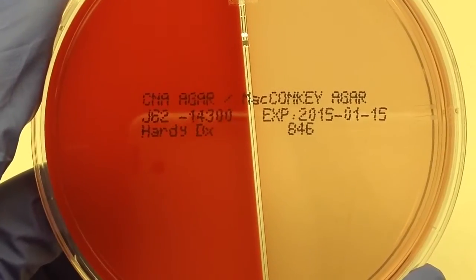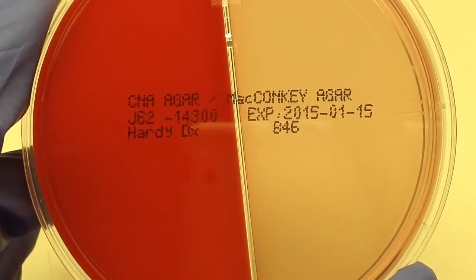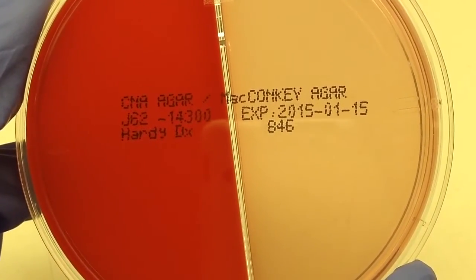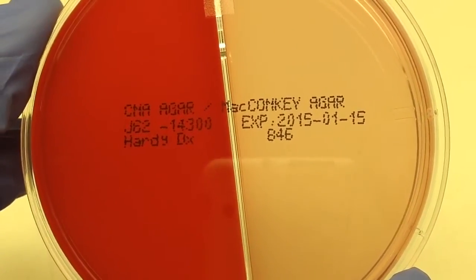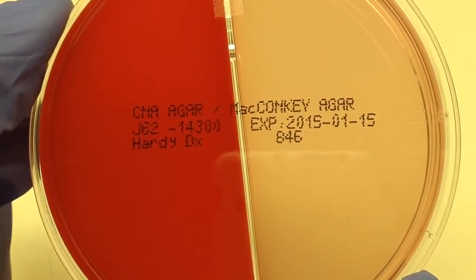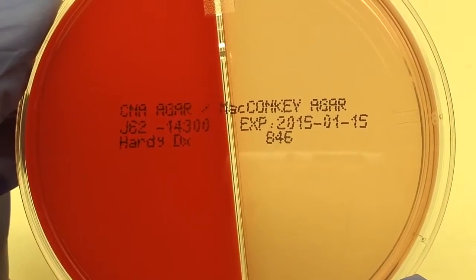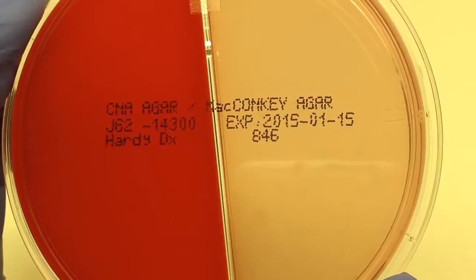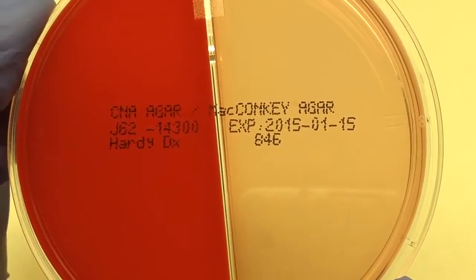The next plate is another bi-plate. It's half CNA and half MacConkey's. The purpose of CNA is it contains the antibiotics colistin and nalidixic acid, and its purpose is to suppress gram-negative growth and support the growth of gram-positive organisms. On the right we have MacConkey's. In opposition to the CNA, it suppresses gram-positive growth and it supports the growth of gram-negative organisms.